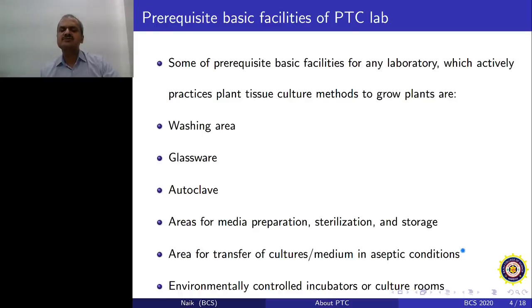Sometimes what happens if you use the same laminar airflow hood for say microbiology work or bacterial handling or some other fungal isolation work, then you need to fumigate that particular laminar airflow hood with formalin and potassium permanganate at least twice within a month, and that can definitely help to have a very clean laminar airflow hood.